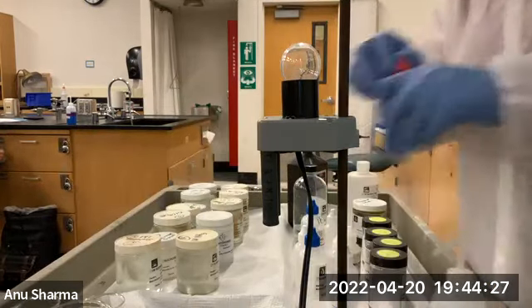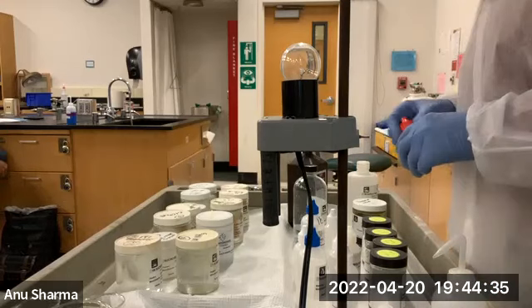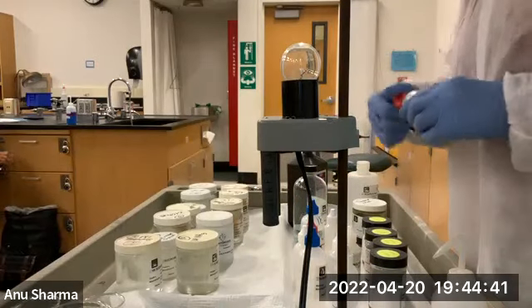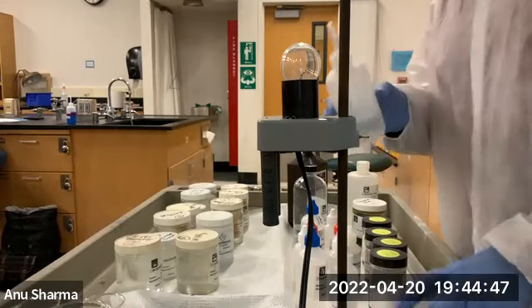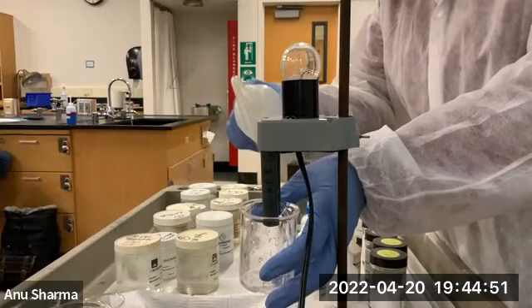Okay, so soluble in water, both of them, due to hydrogen bonding. Acetone as well. Now next comes the isopropyl alcohol. Isopropyl alcohol contains 3 carbons, okay? Acetone also contains 3 carbons. The difference between acetone and isopropyl alcohol is that isopropyl alcohol contains an OH group.